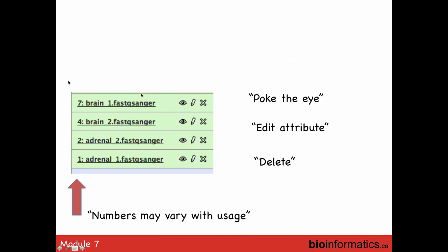Each command in your history always has three icons next to it: an eye, a pencil, and an X. The eye — I call it 'poke the eye' — lets you look at the data. The pencil lets you edit attributes: take notes about that step or rename input/output files. The X deletes a step. The numbers on the left side are just a chronological order of your steps — if steps failed they may not be sequential.